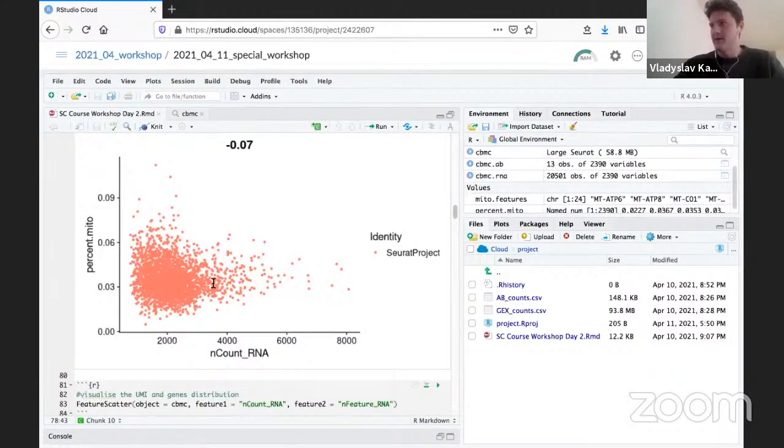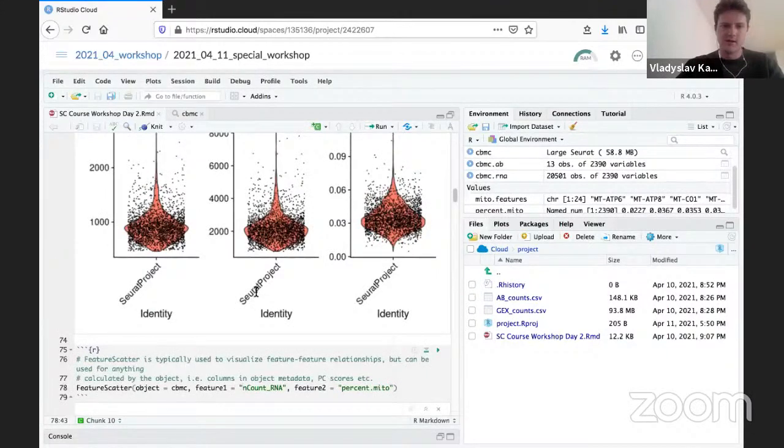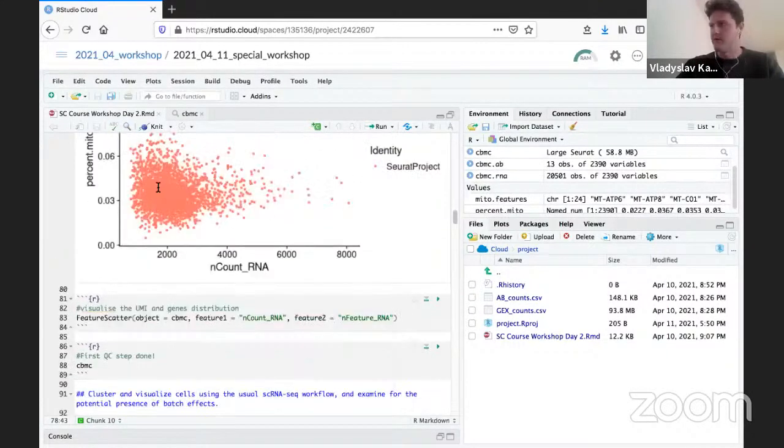That's why I'm saying you need to look at your plots, at all your cells. If you see, for example, some cell population that is definitely over 10 or 15 and just making this narrow cut on the left, those would definitely be the cells that you need to filter out. So do it more flexibly according to the data set that you have. Look at your plots, look at the distribution here, and also at the distribution there.